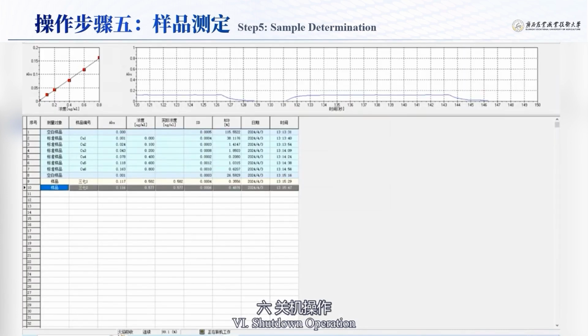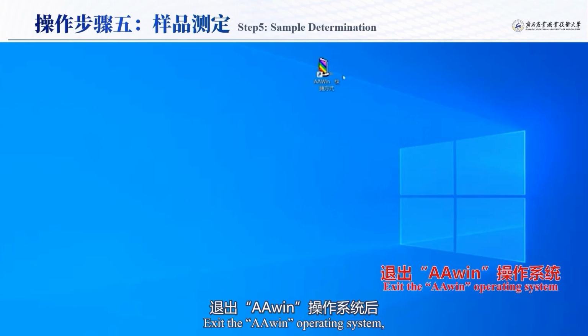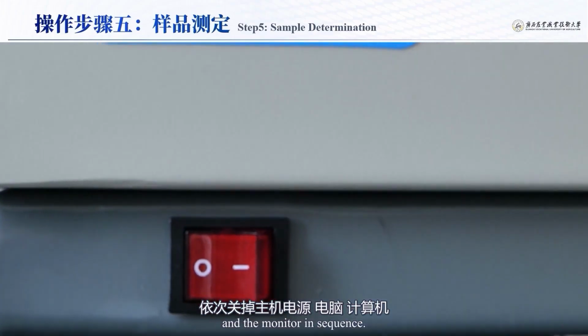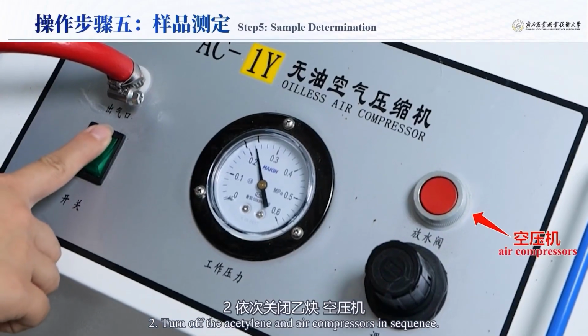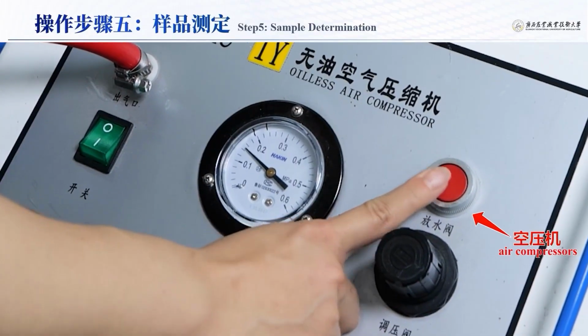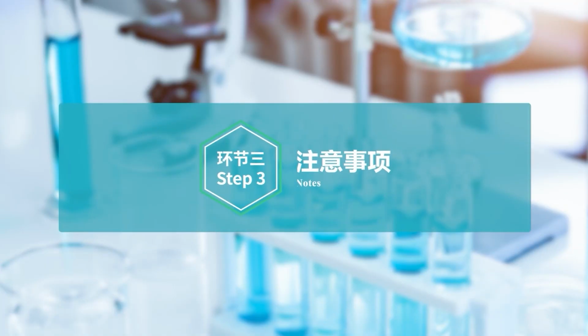Sixth, shutdown operation. First, shut down: exit the AAwin operating system, then turn off the host power supply, the computer, and the monitor in sequence. Second, turn off the acetylene and air compressors in sequence. Notes.